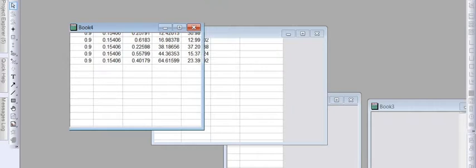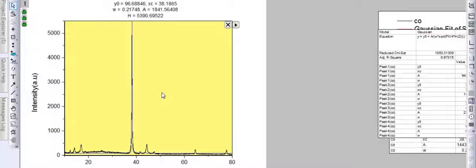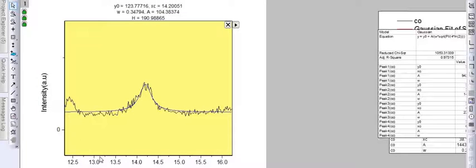Now we will calculate the area of individual peaks. Let us take the first peak. I'm just taking the main peaks so that you can get the idea, because there are so many peaks, the procedure is the same for everyone. So I'm taking just a few peaks.